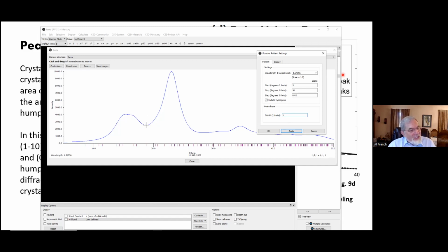That's really why the Segal method has severe problems from a fundamental standpoint in terms of measuring the crystallinity in terms of an amorphous fraction and a crystalline fraction. Now, you may say that if the crystal is smaller, it's not really as crystalline, but that's a different question than saying you've got some perfect crystals and something that looks like spaghetti in terms of the molecular organization. So anyway, that's a little bit of a picture of that.